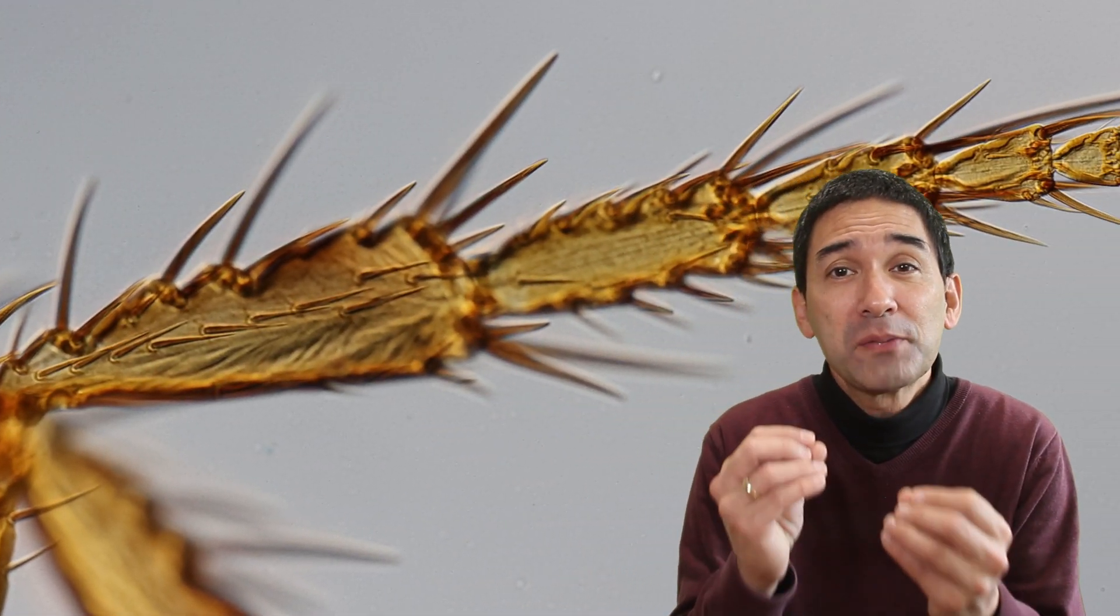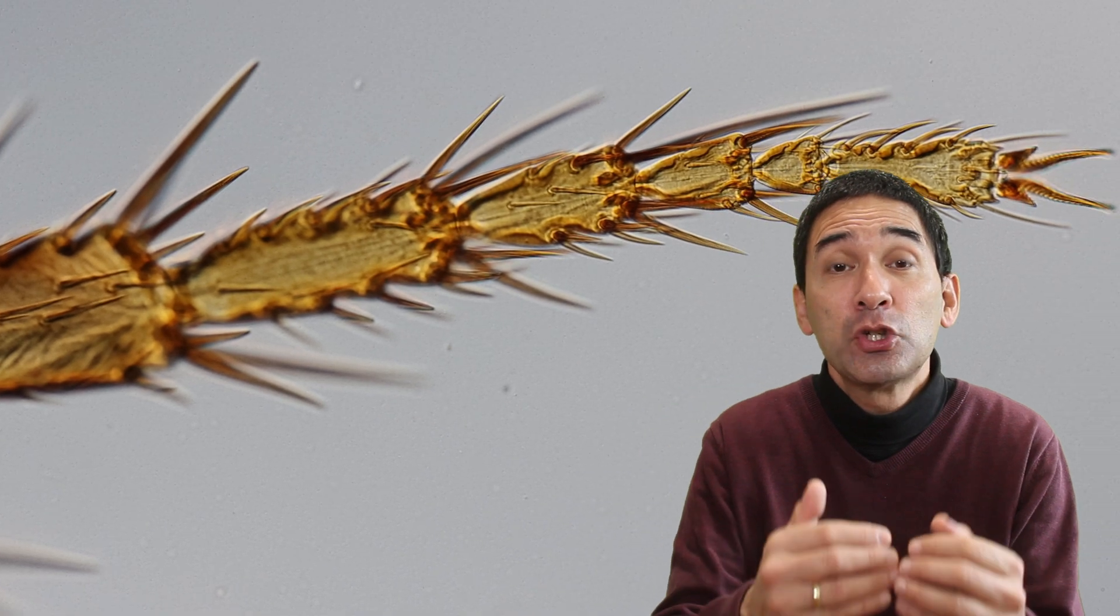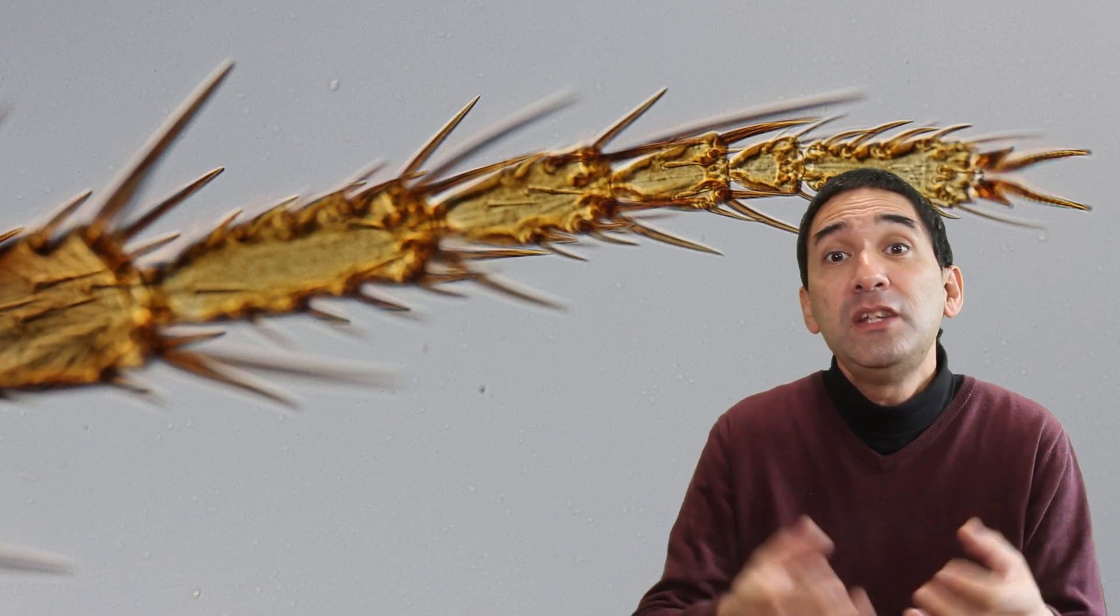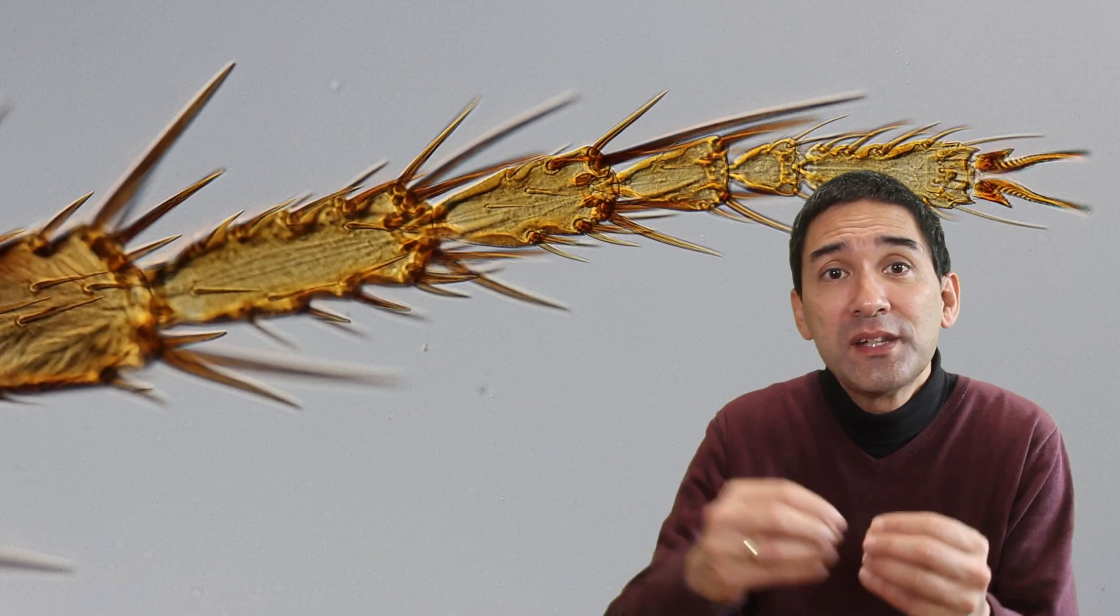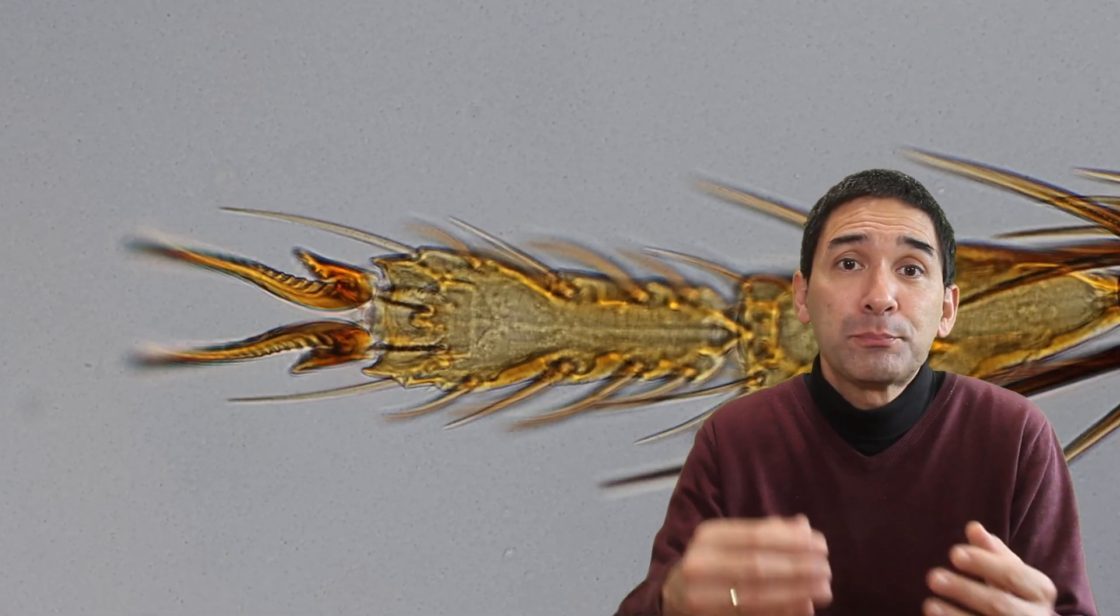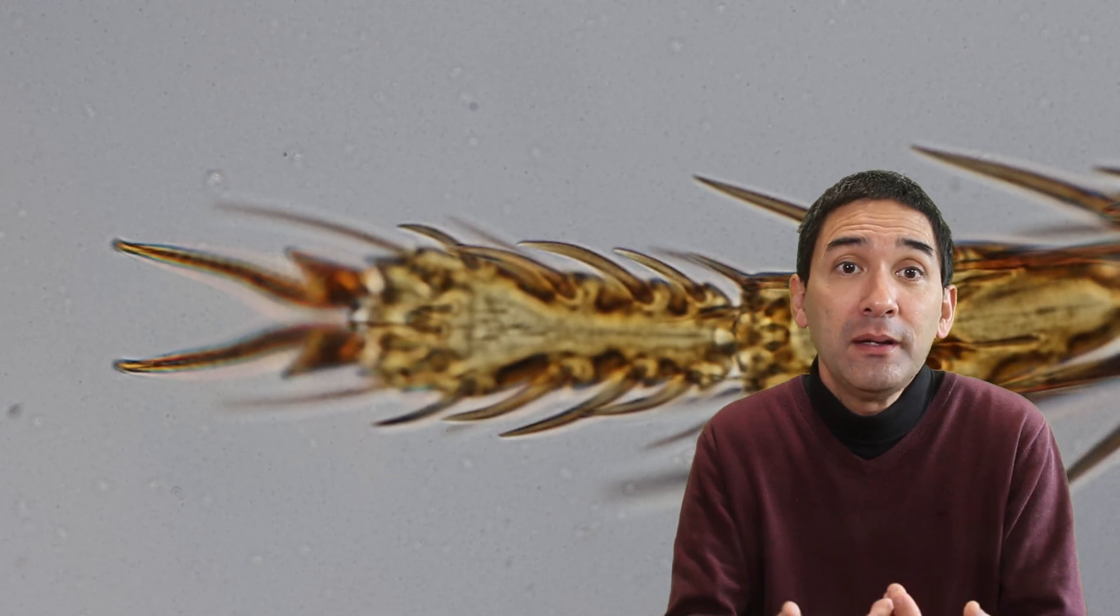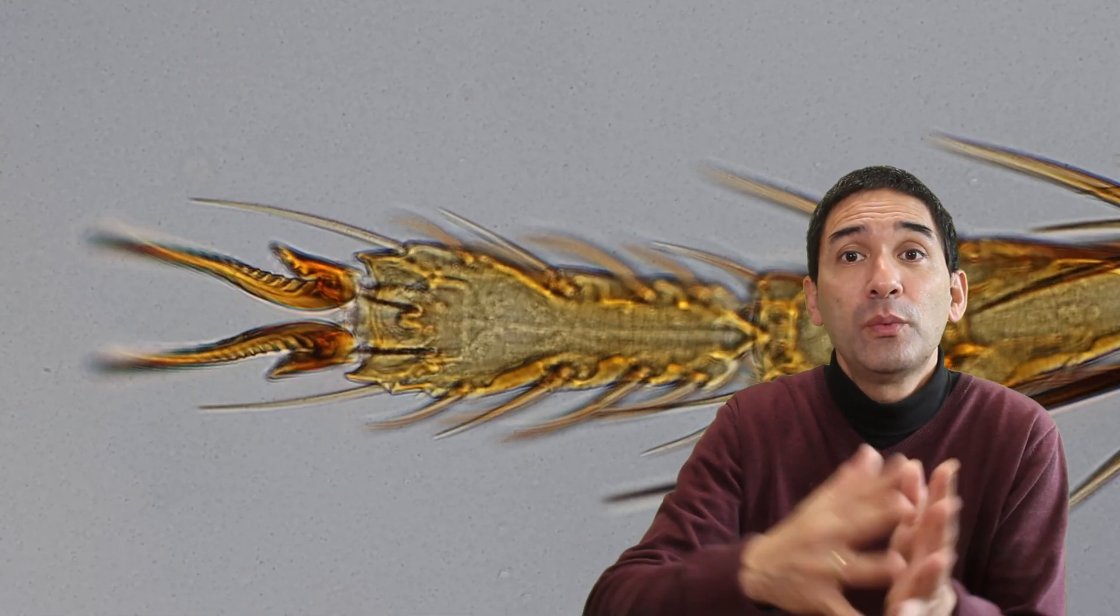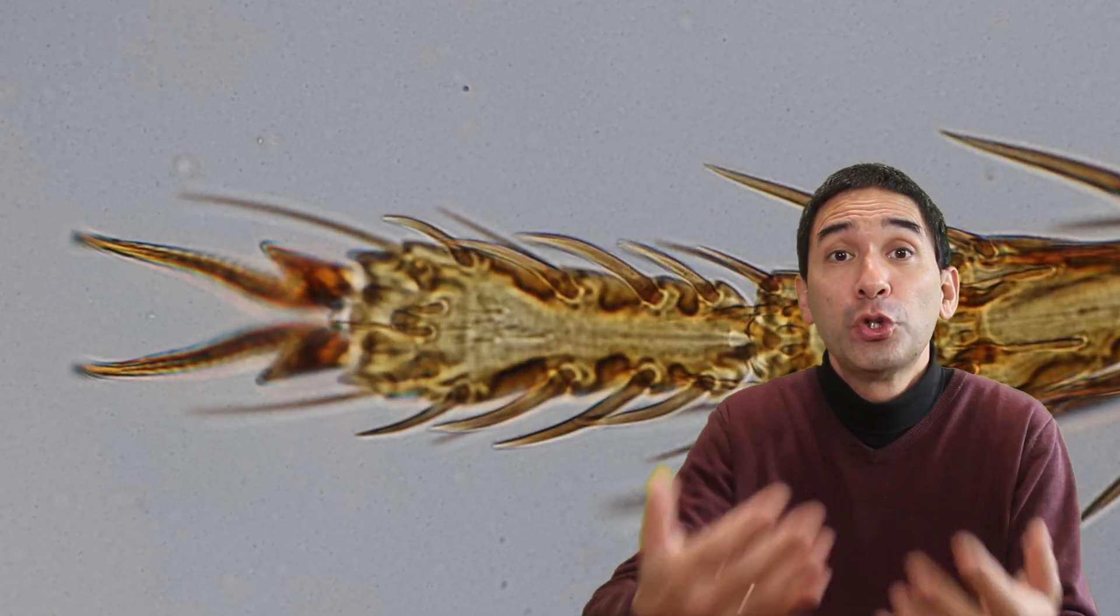For this reason fleas have long spikes on their legs, especially on their hind legs. The flea uses these spikes to anchor itself in the ground when it jumps off. In other words, the spikes prevent the flea from slipping when it jumps. The spikes dig into the surface when it jumps and help to push it off.